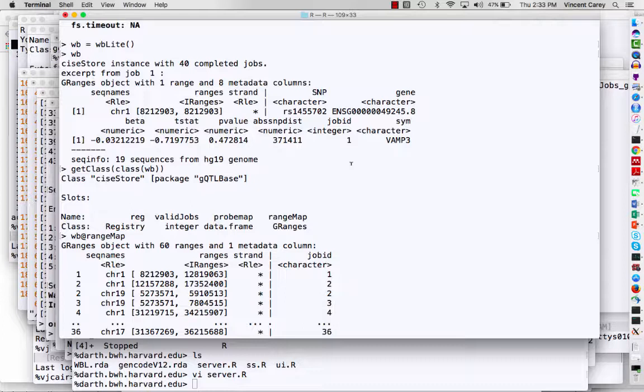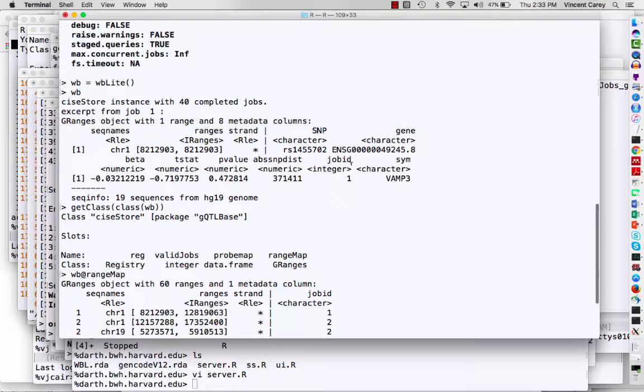It shows us that the data are there and shows us some of the variety of types of information that are close together in chromosome space. But it's really these sorts of objects that we want to be able to build statistical models on, and that's why it's important to have something which is relatively close to the statistical analytic framework, like a GRanges.